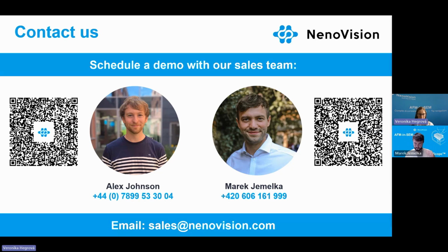For the maximum scan area, our scanner size is 100 micrometers. So anything around it is the maximum scan area.